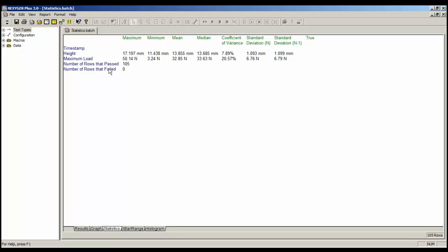The screen also shows the pass-fail status, and it shows that 105 rows passed, or good tests, and 0 rows failed. Now that's because we have not defined any pass or fail conditions. So let's look at adding one of those.